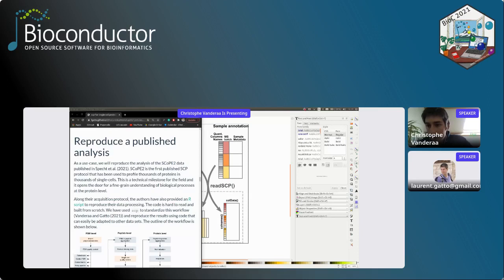We work with genetically diverse heterozygous mice that may have both a reference and an alternate protein sequence. Okay, so this identification is done by, typically, people downloading the UniProt database, where they have all sorts of protein sequences. Since during the experiment we use a specific enzyme, trypsin, we know where trypsin digests, and so we have different peptide sequences. Based on this, we can have a set of predicted spectra, and then we can match the theoretical spectra from the database with the actual spectra that you measure.